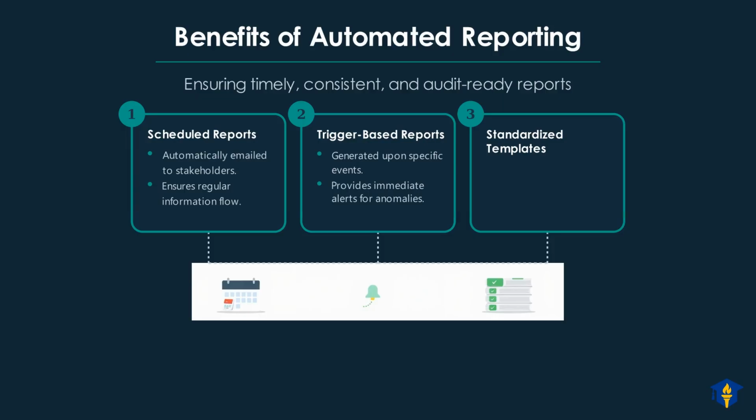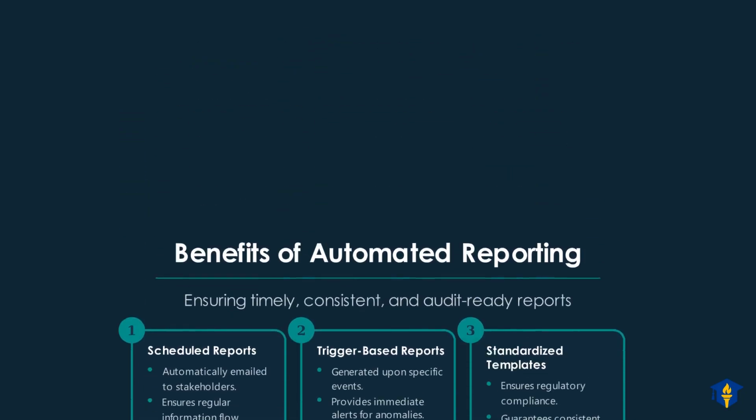Finally, utilizing standardized templates for all reports offers significant advantages. These templates ensure that all reports meet strict regulatory requirements, promoting consistent compliance. They also guarantee consistent report formats across all departments, enhancing clarity and professionalism.